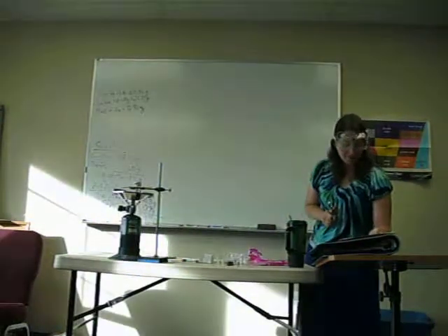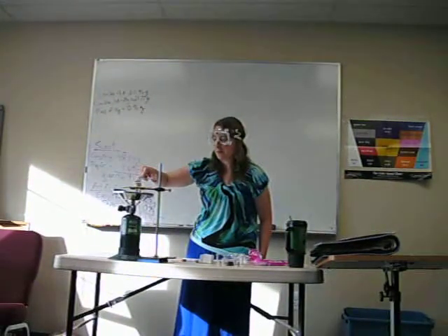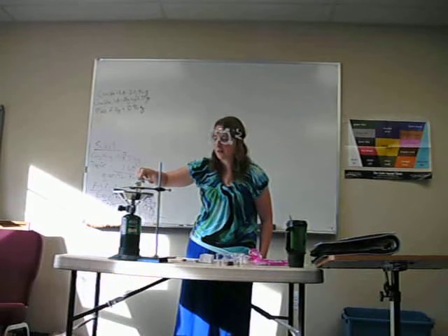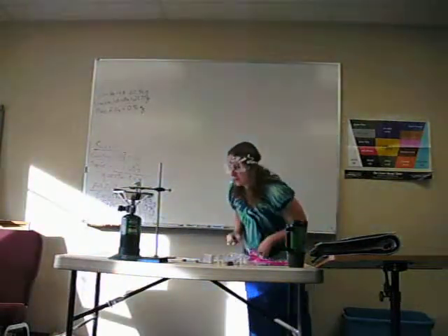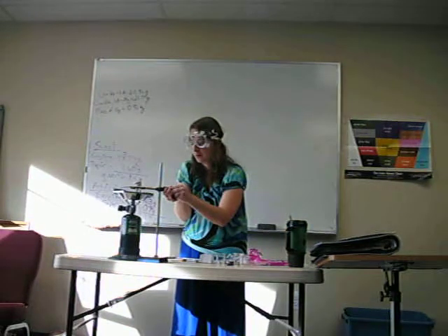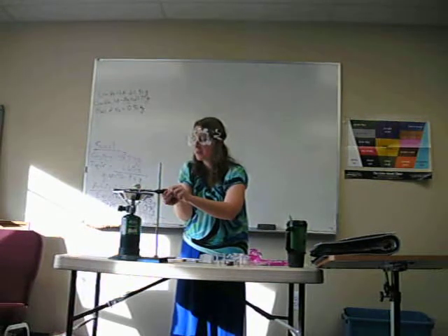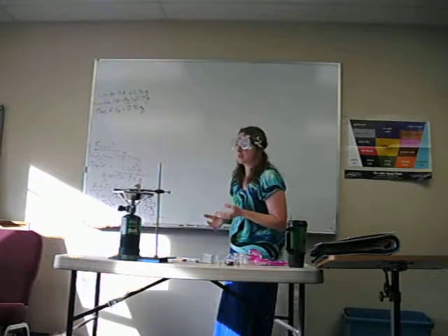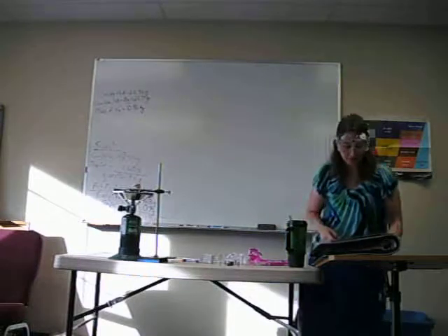Perfect. Okay, so this takes a while, and I'll occasionally fan it a little bit with the lid to try to get extra oxygen in there so that it uses up oxygen. If anyone thinks the fumes are awful, we can absolutely open the window or anything we need to do there. Crucibles are meant to be heated to a very high temperature. Let's hope our little guy is a good one.